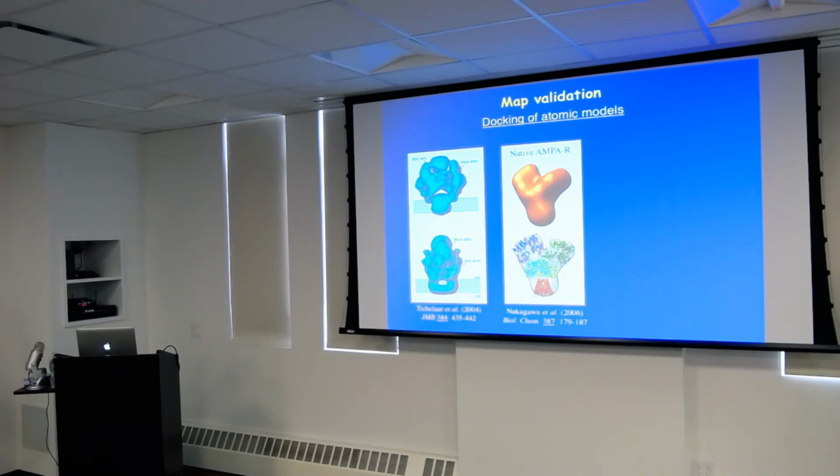I have one more question. When we were talking about the heterogeneous and homogeneous classes, we said that when they are stable and reproducible, it means that they are homogeneous, right? The classes that we were talking about. When they are stable, the classes, and they are reproducible. Yes. What does that mean, reproducible?